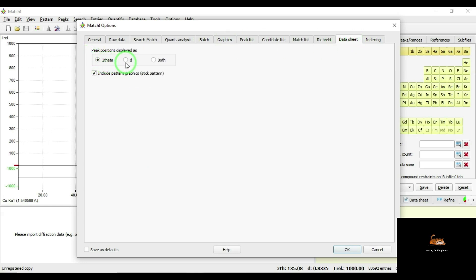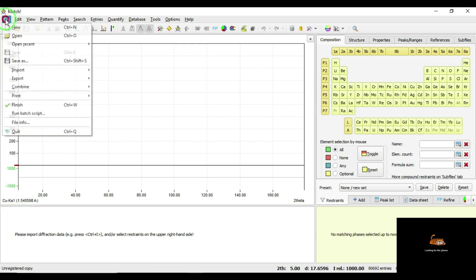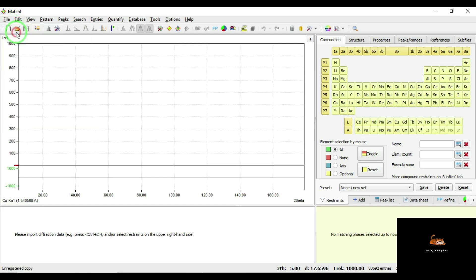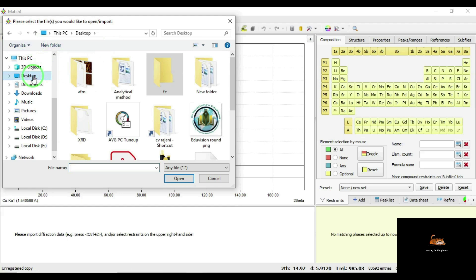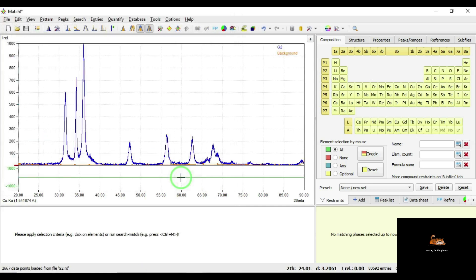You can select 2-theta or D only. Here I am going to select 2-theta. If I select 2-theta, it will show the XRD characteristic peak position in terms of 2-theta only. Click OK. Before processing of data, go to the File menu and click Open. Select the corresponding XRD data file — this is nothing but the XRD data file of my sample. Click OK.